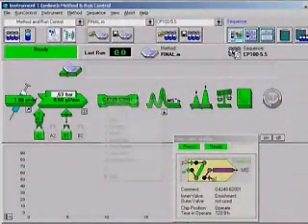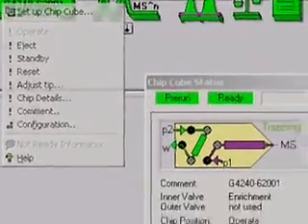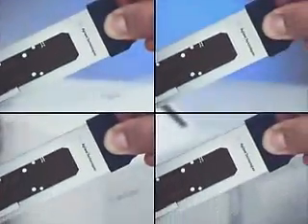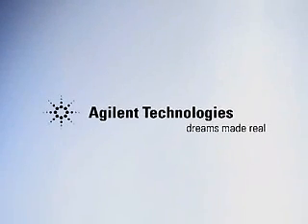The HPLC chip-MS interface is a standard module within the Agilent 1100 series LC system and is fully controlled by the Agilent ChemStation software. Step by step, chip by chip, Agilent will enable new applications in life science, pharmaceutical and chemical analysis. HPLC chip-MS — a bold step into a new world. Agilent Technologies: Dreams made real.